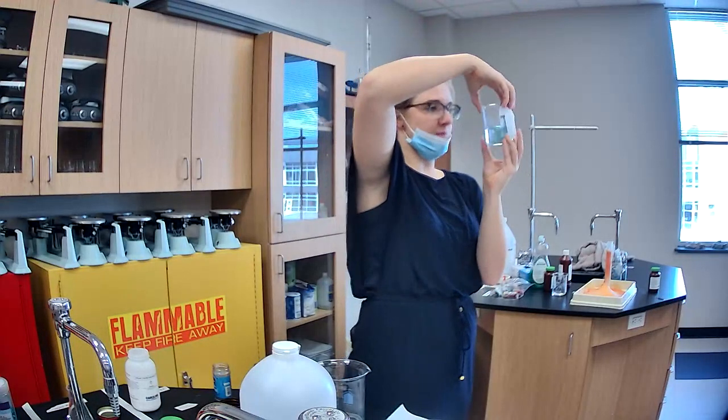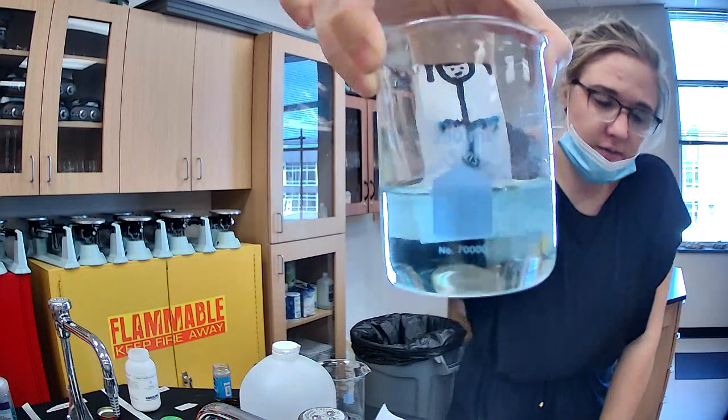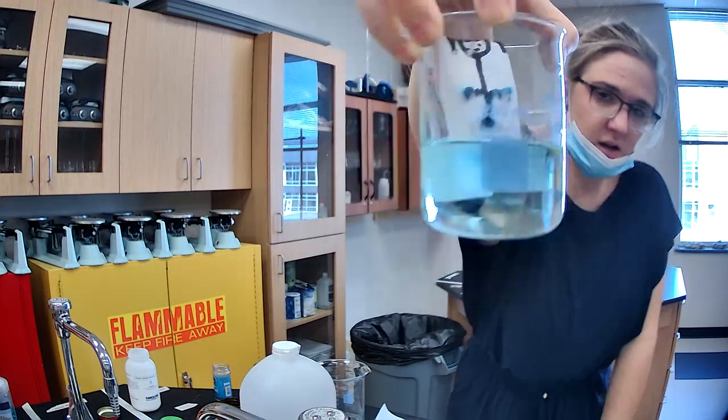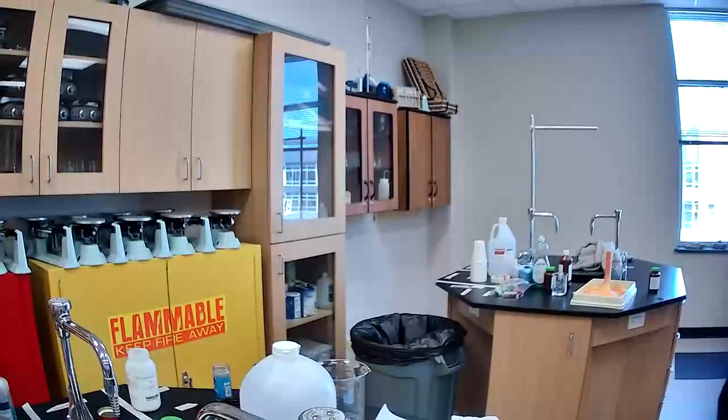We thought the marker was black. It's not. Blue. His arms are melting. His legs are melting. What kind of colors do you see? Purple. I see a bit of blue and some violet. Looks like light turquoise and violet. I do mostly violet. And blue.